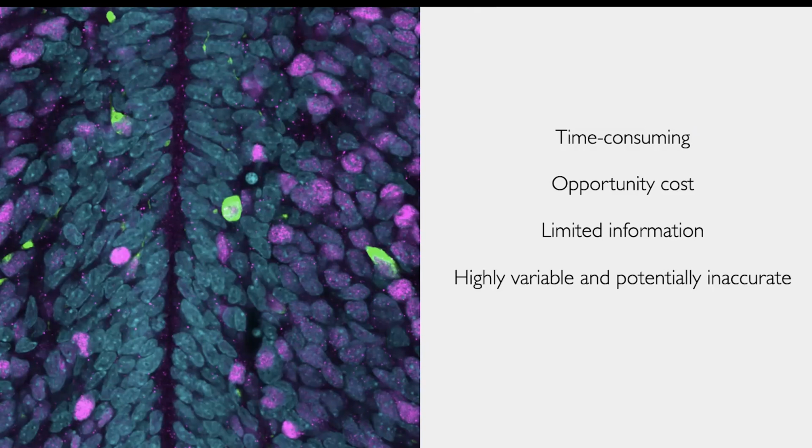Even if you yourself have very strict rules about how you're planning to count these cells, day to day, it's going to vary. It could be the intensity was slightly different the next day, or you were in a room that was slightly brighter and the screen was more difficult to see. There are so many things that can impact that, as well as bias. Even if you're not blinded, and hopefully you are, but if you're not blinded, then you may start to skew the results in one way or another, even unconsciously.